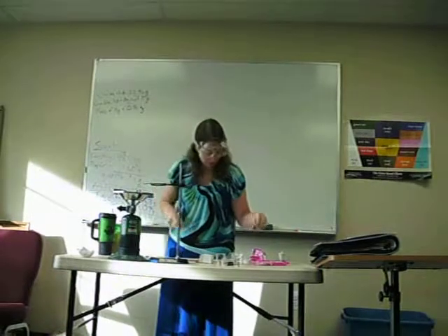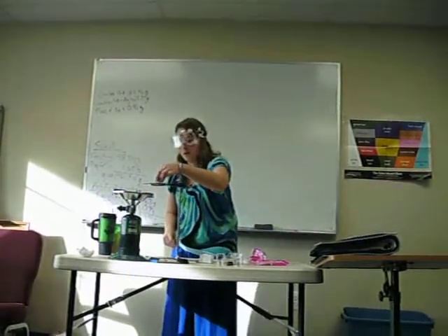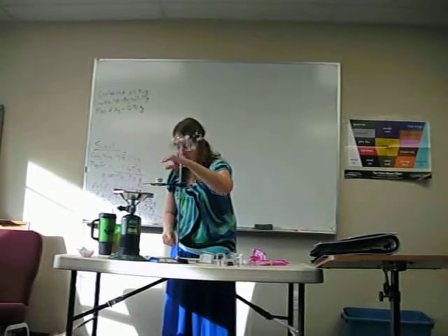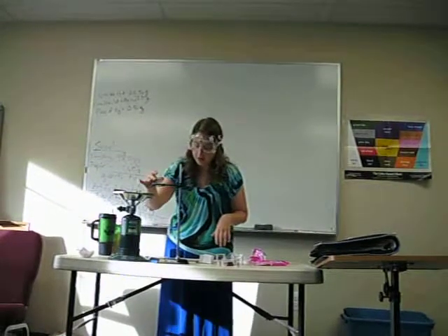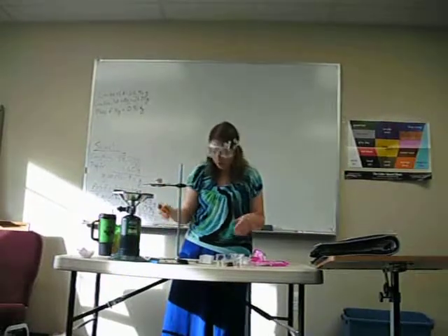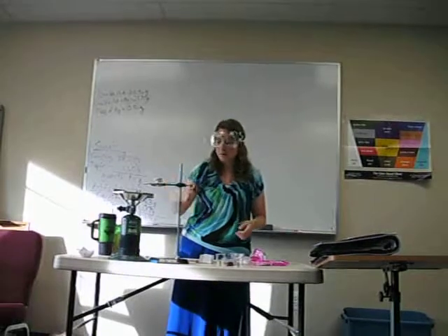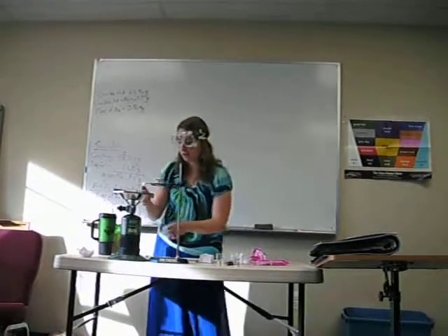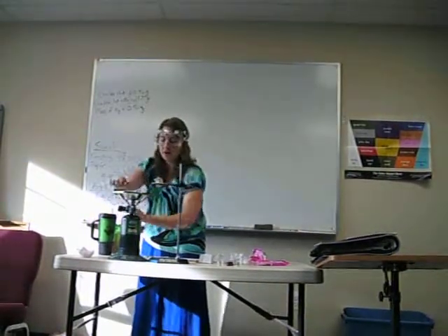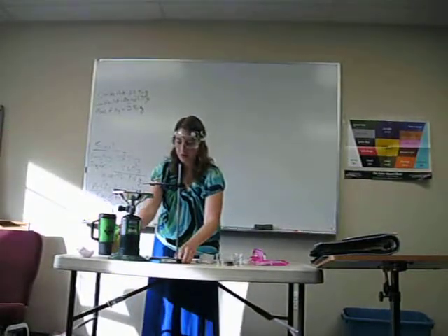So we're going to heat our crucible on a triangle over this flame. And the touchiest part of this is to get enough oxygen into there so that it has enough oxygen to react with without... Do you want me to turn on the fan? That probably is a good plan.